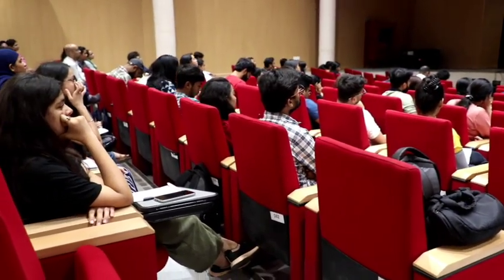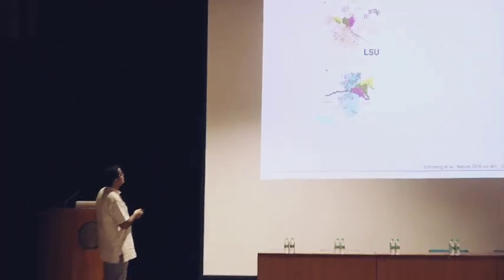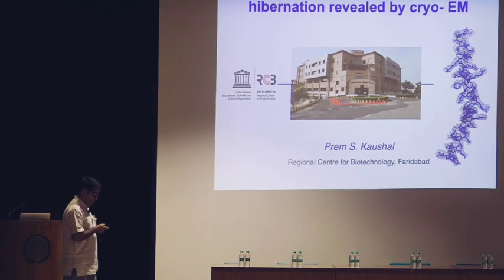Today I will be talking about a story, a unique mode of mycobacterial ribosome hibernation that was revealed solely by doing cryo-electron microscopy.